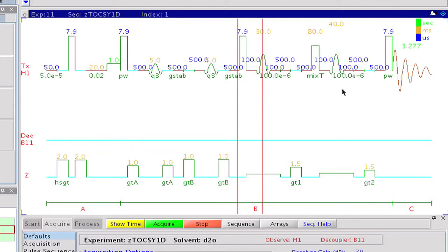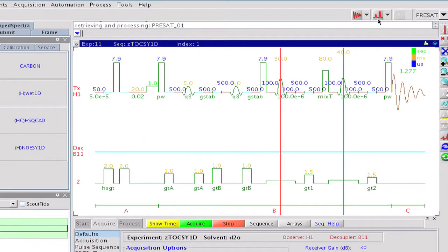Mixing is flanked by two zero-quantum suppression elements that filter out signals of a competitive process that frequently causes multiplet distortions. In every selective experiment, the key step is to define the site and the bandwidth of the selective RF pulse.